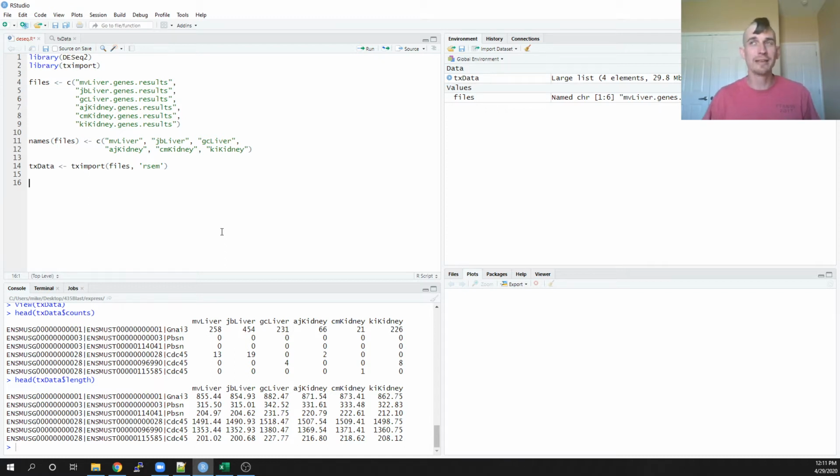Most of these aren't going to have any expression values with them. So what I have to do is change my lengths so that any time there's a sequence of length 0, I'm just going to change that to a length of 1. And as I said, nothing in R is intuitive, right? So this is a Googleable command. This is something I had to Google.